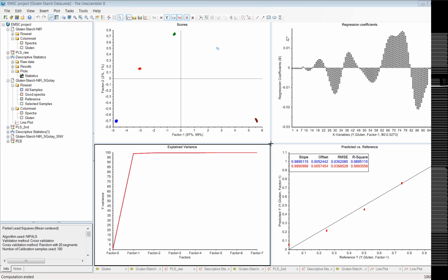Right. So the question is, in this example, I knew that the sample is a single factor, but if there's a case where I don't know how many factors it should be, how do you determine what type of pretreatment? So the way to determine the pretreatment is actually the same. You would still do those descriptive statistics, look at your scattering plots, look at your raw data, see if there's any areas that stand out to you as well, so that might help you with some variable selection.